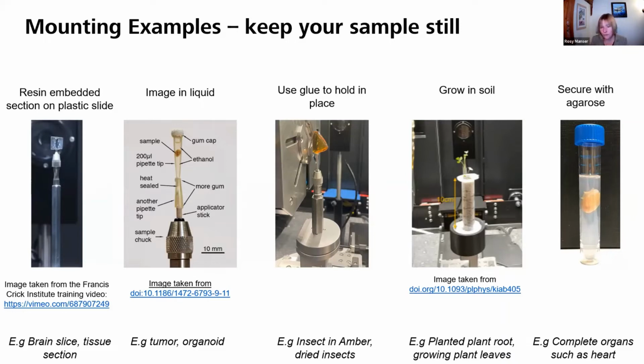I've seen some crazy setups in my time: Lego, polystyrene, blue tack, sellotape, all sorts of things used to keep the specimen still. But these are a few examples. On the left-hand side, we have a resin-embedded section on a plastic slide, taken from that video I mentioned from the Crick. It was glued onto the pin to keep it still.